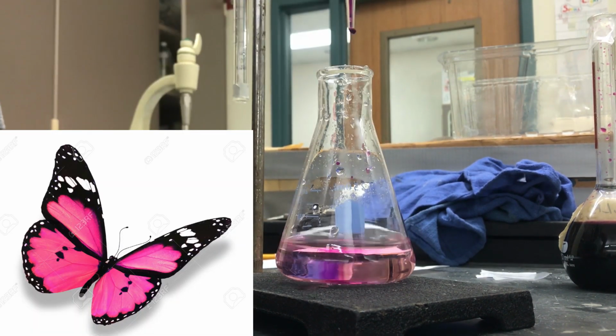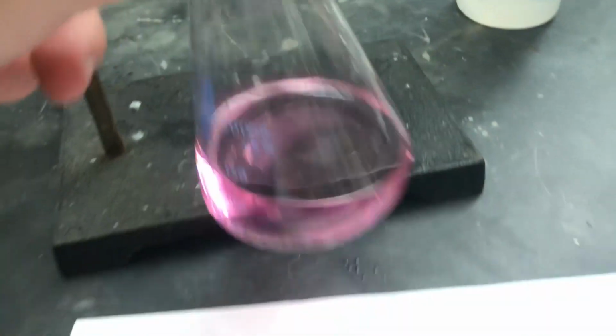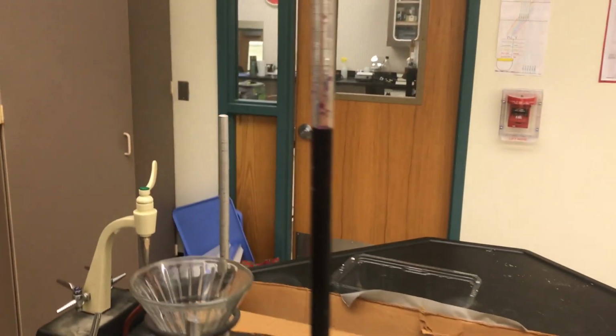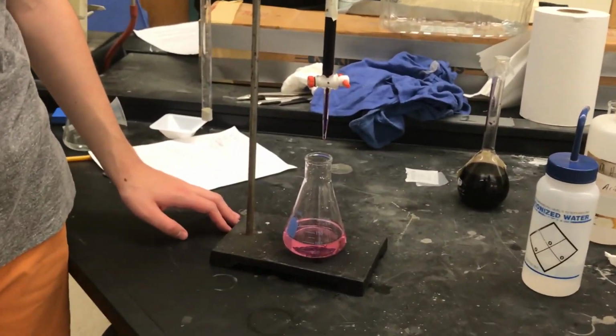Oh, we got it. That's pretty good. Now our titration is finished, although it could be a little less pink. Don't forget to record your final volume. We're going to do this 2 more times for a total of 3 successful trials for the most accurate results.